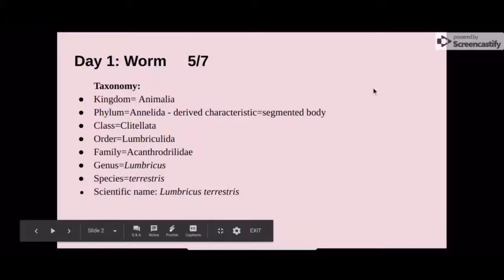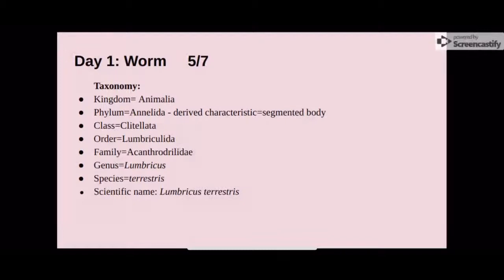This is our dissection project, and the first organism that we dissected was the worm. Its derived characteristic is the segmented body, and its scientific name is Lumbricus terrestris.